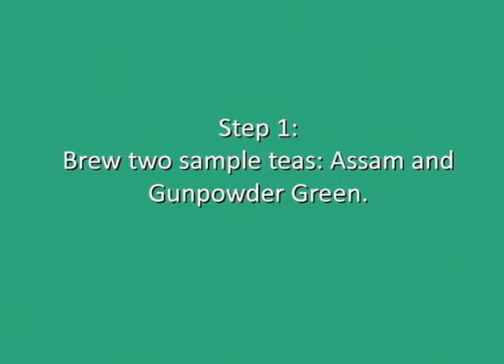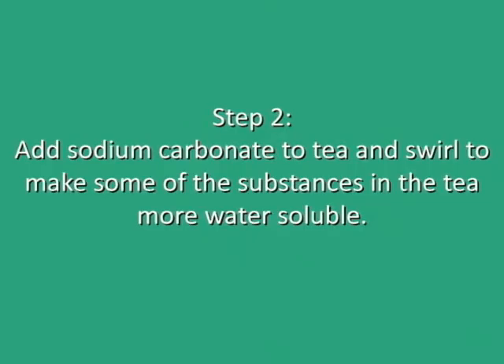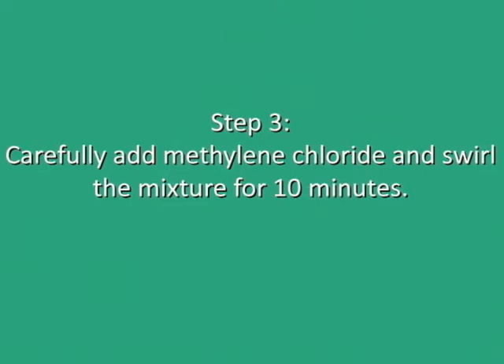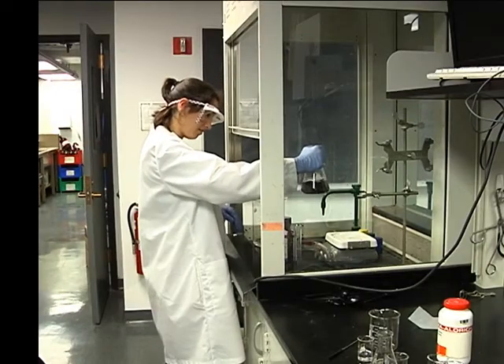First, we steep our sample of Assam and gunpowder green teas for two minutes. Then we add sodium carbonate to make the components of the tea water-soluble so they will easily dissolve in water. Next, we add methylene chloride to the tea and then swirl it for ten minutes so that the caffeine can dissolve into it.